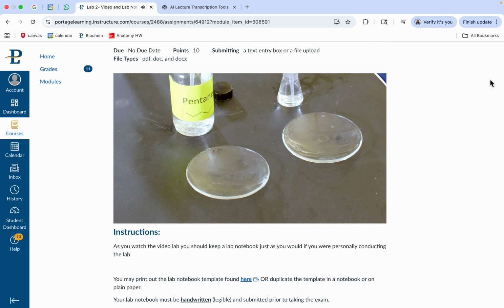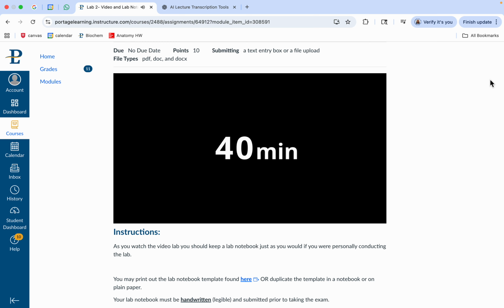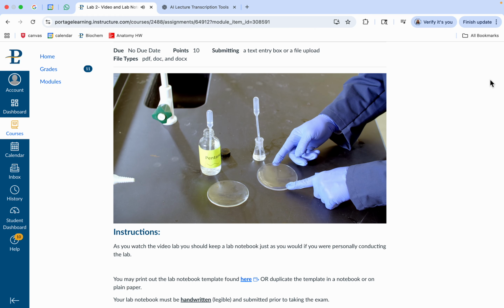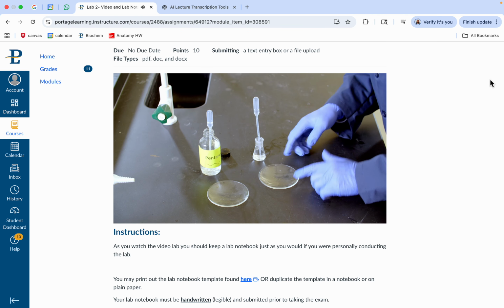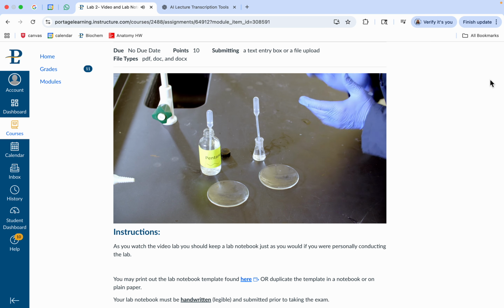Now notice with the water. The water still has a pretty large amount of it there. I would think it'd be safe to say that at least 98% of the water is still there. Hasn't really looked like it's changed much at all. Okay, so we're back, and the pentane only took about 33 seconds, and we're now at about 56 minutes, and the water is still there, just barely, I think. And I think there's just a couple little droplets there. All right, so we'll call it, say, 56.5 minutes that it took for the same amount of water to evaporate.